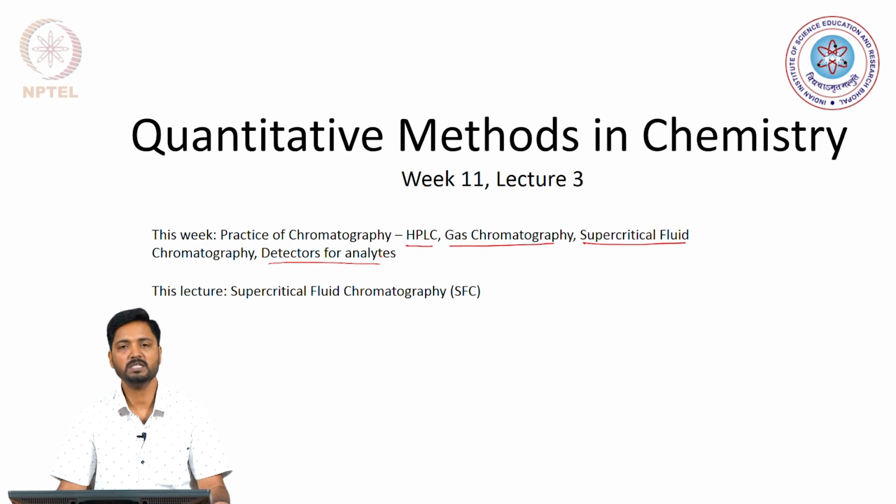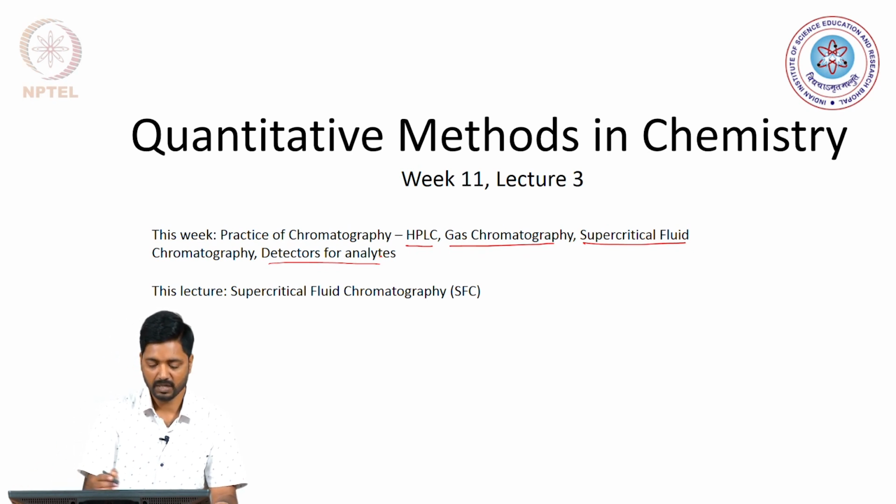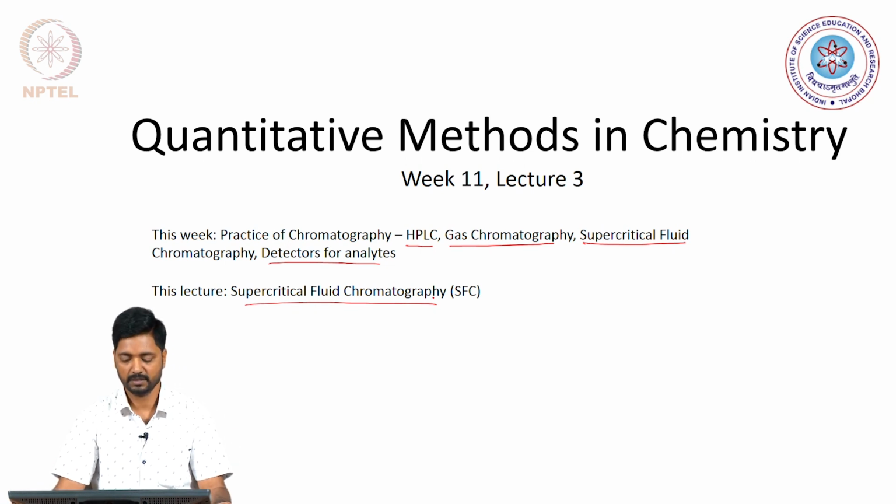So, this lecture is specifically dedicated to the supercritical fluid chromatography, and let us try to understand what this concept is and what are its unique advantages and disadvantages vis-a-vis the traditional techniques such as high performance liquid chromatography and gas chromatography.